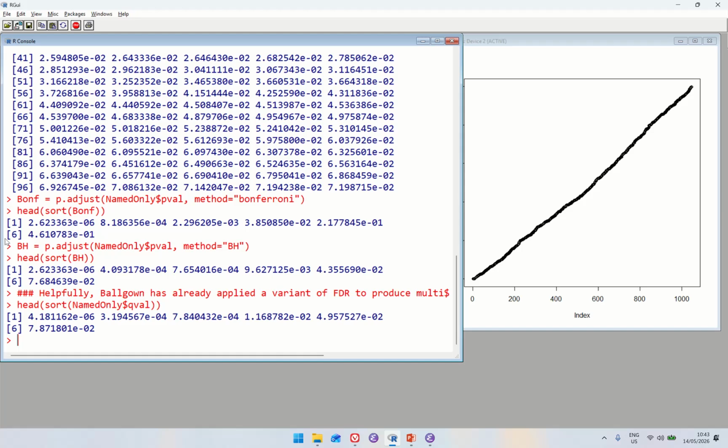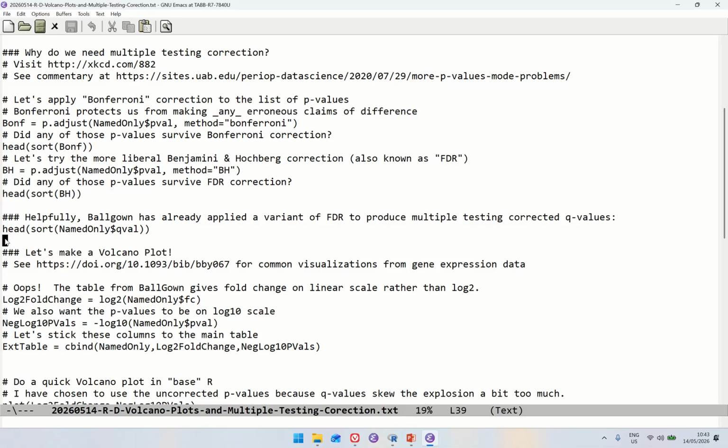It was looking at all the transcripts. And they may be using one of the slight refinements on Benjamini Hochberg. So these numbers are not identical to what we see above. And I think that mostly reflects the fact that we've limited to just those with the gene symbols on them more so than anything else. Most typically, Benjamini Hochberg is just used very widely without modification. Okay. So we already have those values in here. I don't think that we need to make an additional correction beyond what they've already done.